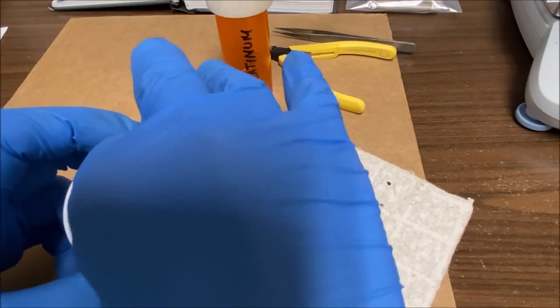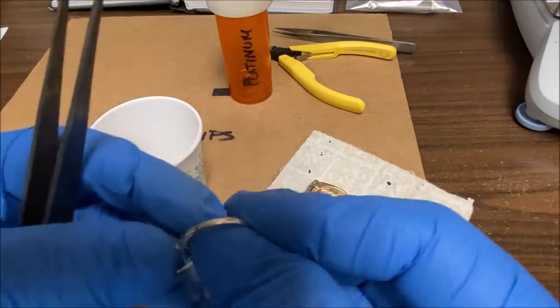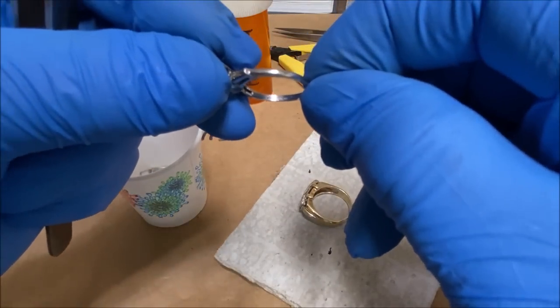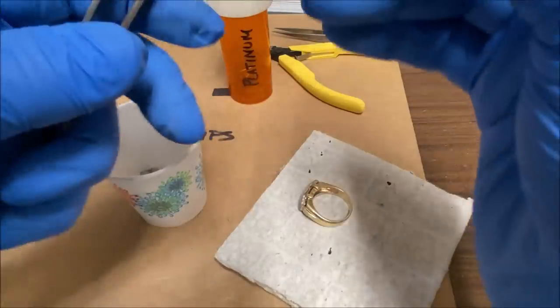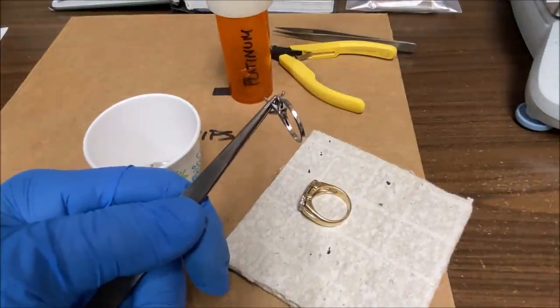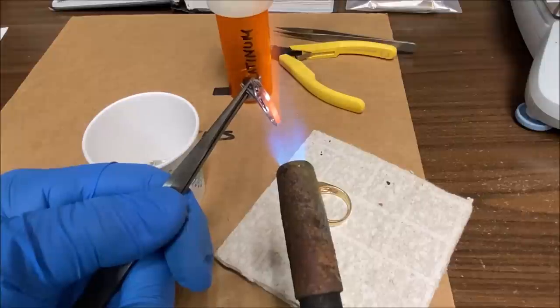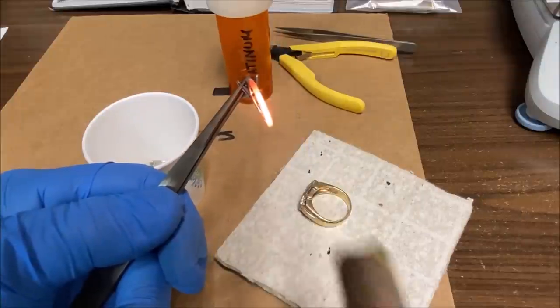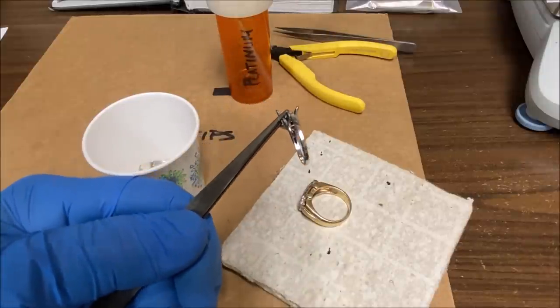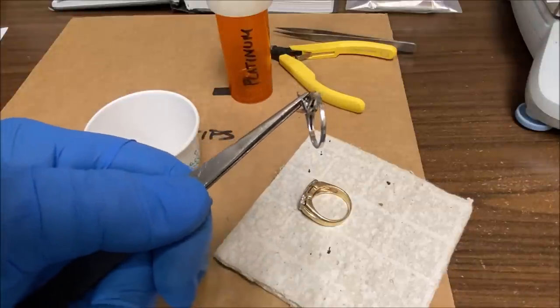There's a convenient way to determine if we've got platinum or not. And what we do is, let's see, I got a mark on it. Yeah, it's platinum. There's a mark in there. And the way we do this is just take an open flame and burn this, heat it to redness. And when it cools back off, you won't even be able to tell that a flame has touched that metal. That's a unique property of platinum.